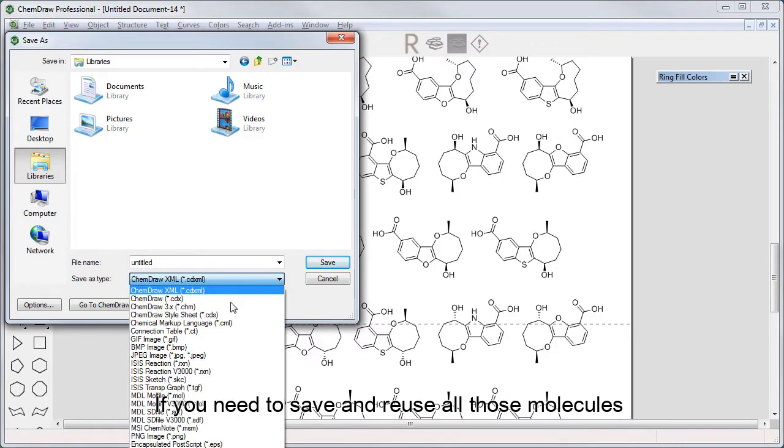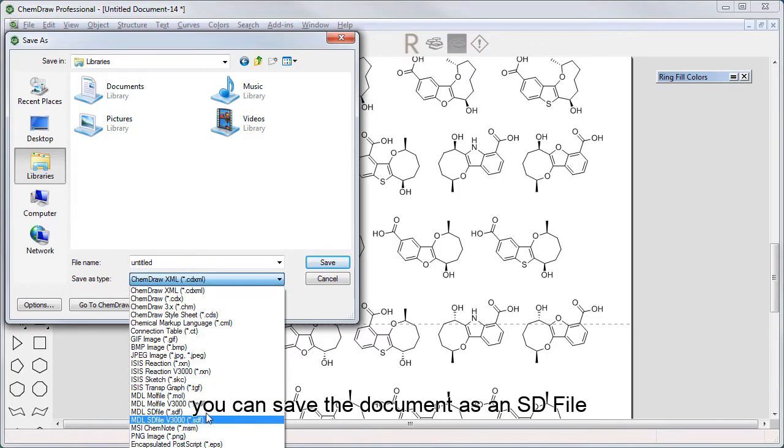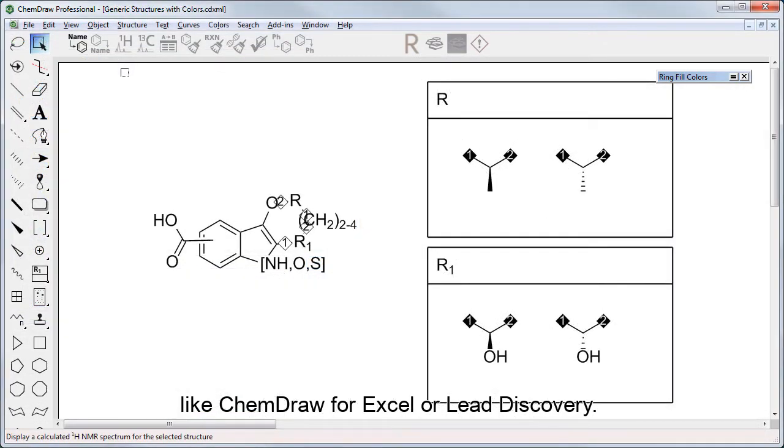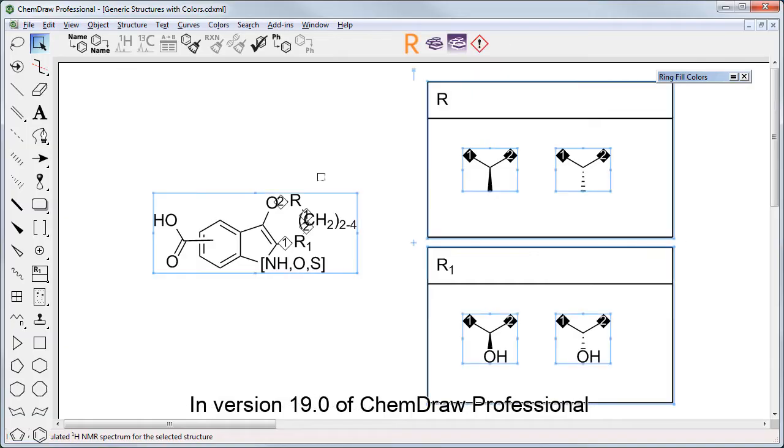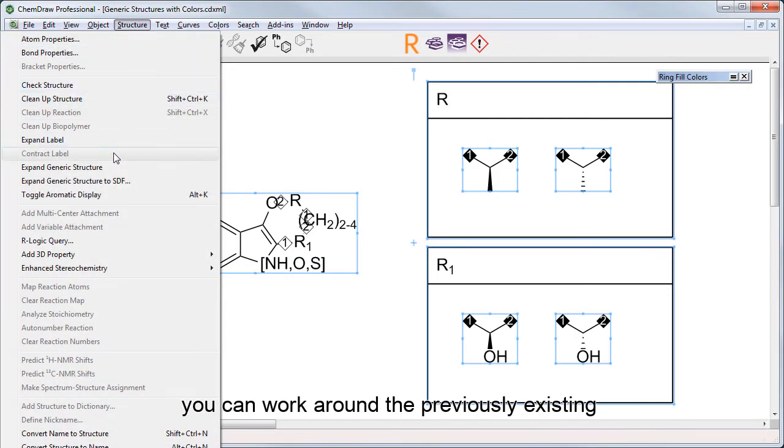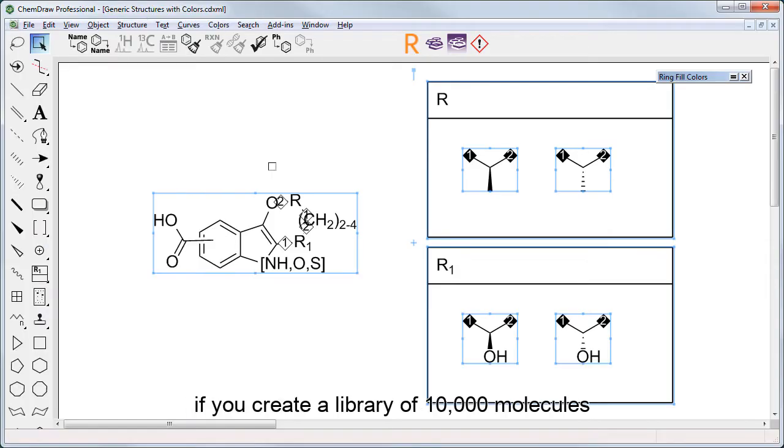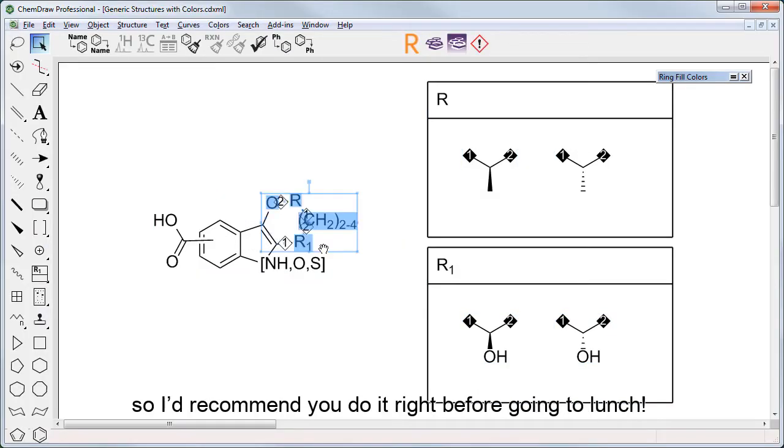If you need to save and reuse all those molecules, you can save the document as an SD file and import that into another application like ChemDraw for Excel or Lead Discovery. In version 19 of ChemDraw Professional, you can work around the previously existing upper limit of enumeration of 500 and enumerate directly to an SD file. Bear in mind that process may take a while if you create a library of 10,000 molecules, so I'd recommend you do it right before going to lunch.